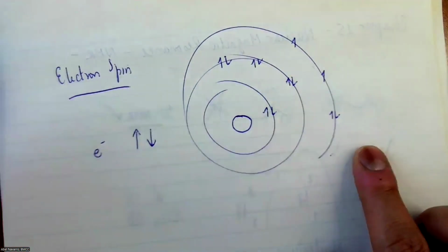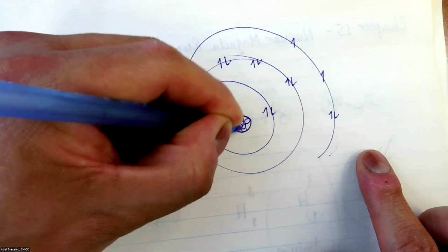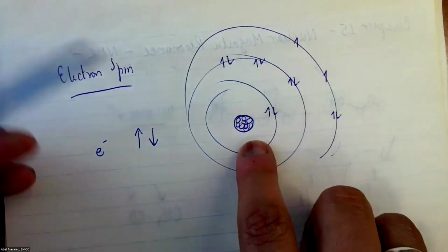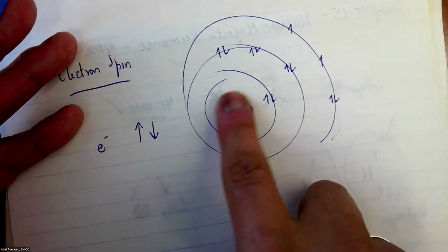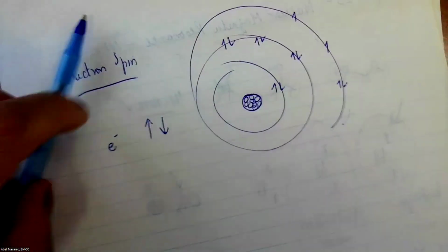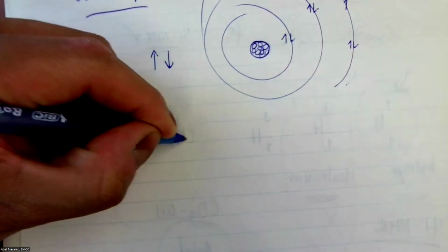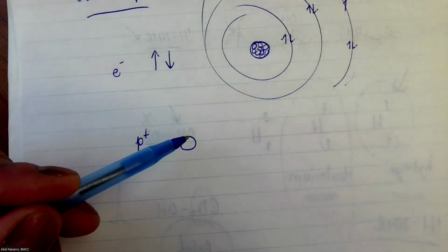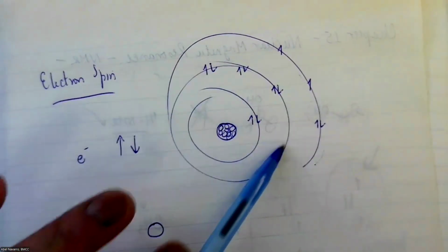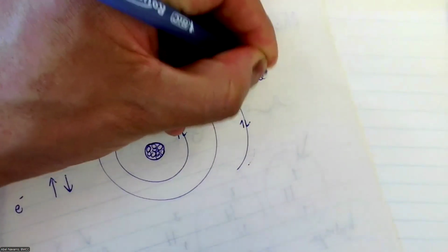But the nucleus also has protons inside, which is normally underestimated. We normally don't study the protons that much because they don't have a structure. They are all merged and blended in that sphere, which is what we call a nucleus. But the protons happen to have a spin. These protons are also moving constantly, maybe not as much, since they don't have as much space as electrons have to move in the electron cloud.